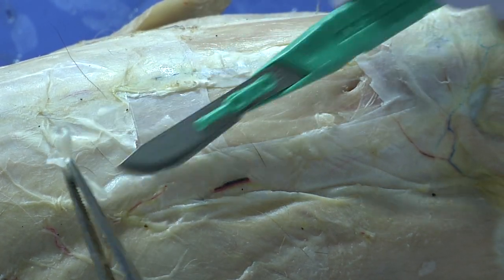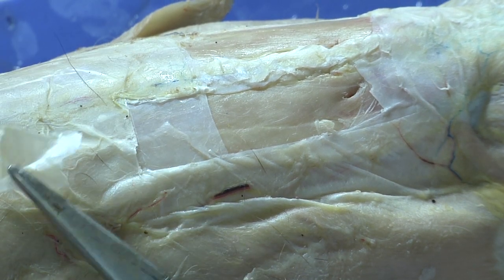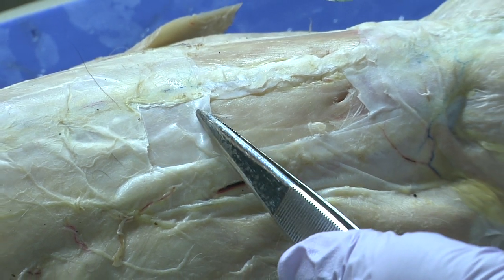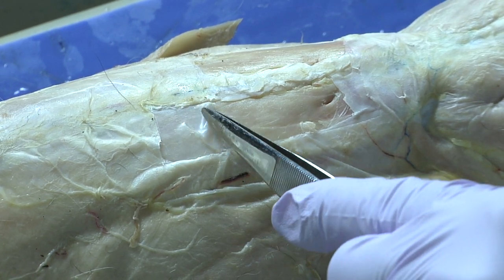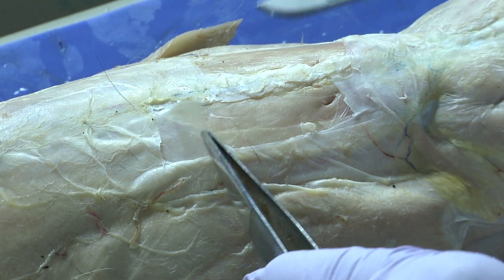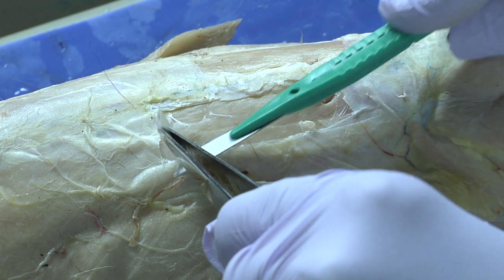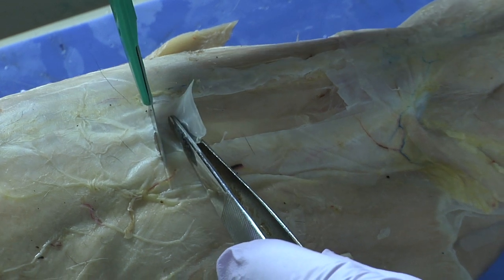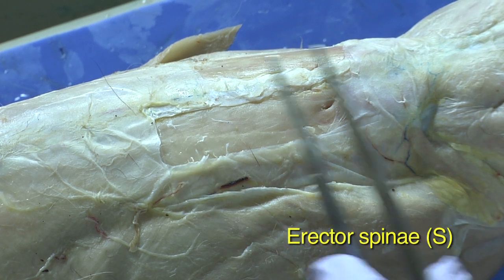This is the dense irregular connective tissue — this is just the first layer. There's another layer that will also need to be removed to actually get to those muscles. The forceps will come in handy here to help you get through so as to reveal those muscles. And these are the erector spinae.